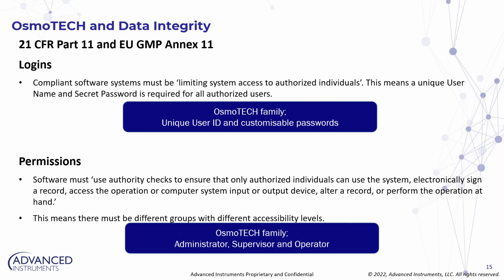So here on the OsmoTECH family of instruments, you have 3 levels of user access. You have administrator, supervisor, operator. And the administrators are sort of the super user, and the rest of their access and permissions can be customized, because we know no 2 labs are the same. So if you want your supervisor to be able to calibrate in one lab, or if you don't want them to be able to perform any calibration, that's fine.